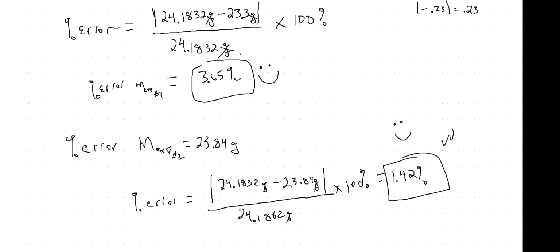Again, there'll be certain conversions where you measure the length from the tip of your nose to the end of your finger, and you want to convert that from inches to centimeters or centimeters to inches. And so it's just practice, okay? But other than that, this is the gist of the whole experiment. And I hope it's good. Okay? That's good.